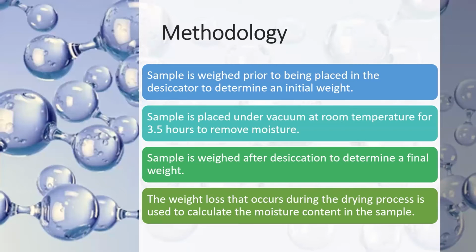It's important to note here that when weighing samples post-desiccation, it must be done immediately because if not, states that have really high humidity are going to start absorbing water again and the results will be skewed. And this also applies if a lab is using an oven instead of a moisture balance for loss on drying methodology.